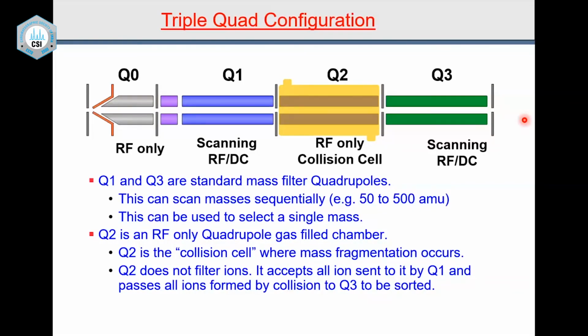So the advantage of MS/MS is tremendous. And now when you go to bioanalytical, there are many people in bioanalytical. You have a dirty sample from the blood, and you do some sample preparation, but still when you take it, the sample is very impure. So do the MS/MS of this dirty sample, but for the compound of interest, you focus on that ion and bring that ion in and you decompose it here, and you can see the spectrum here. So you can see the bioavailability at different times.